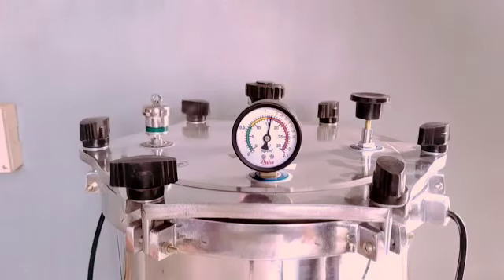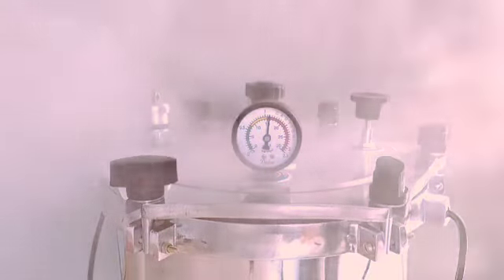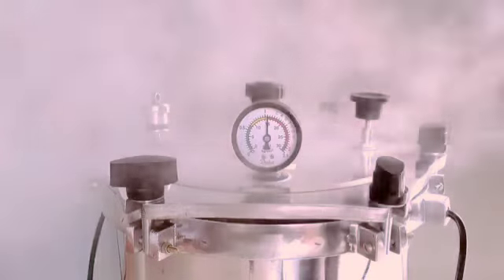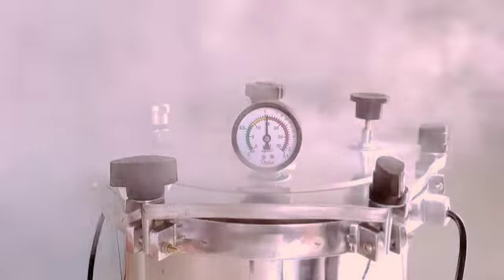Once the gauge reading is at 15 to 17 psi, the pressure regulating valve or safety valve 1 comes into action, begins to whistle, and may or may not start to blow off excess steam. After several seconds of blowing off excess steam, the pressure reading goes back to just below 15 psi or so, and the cycle continues.